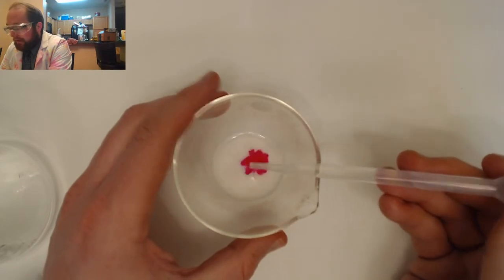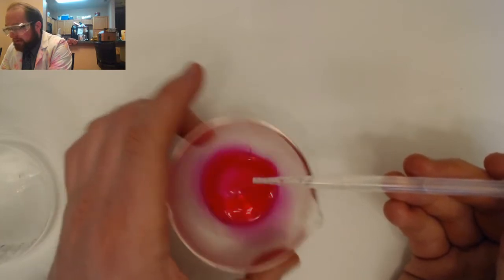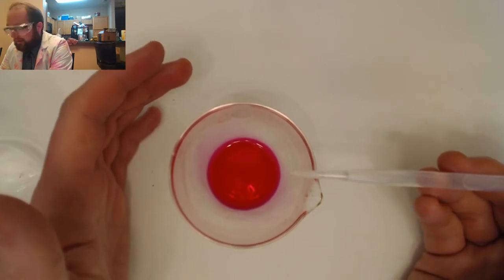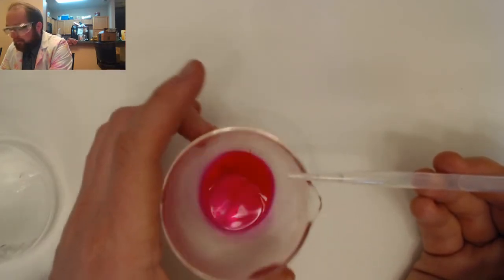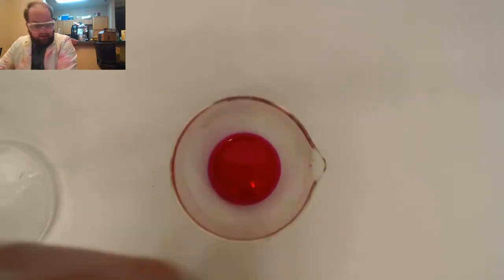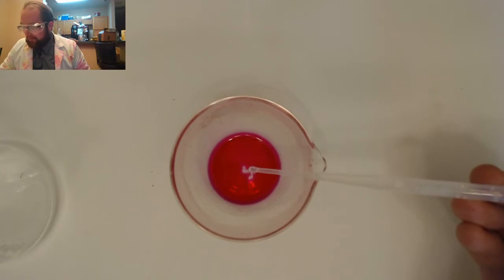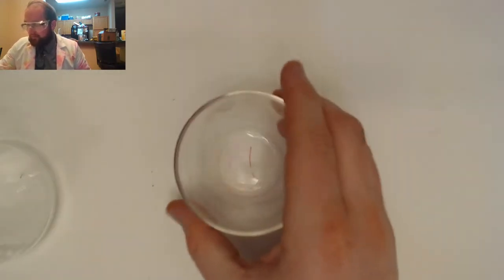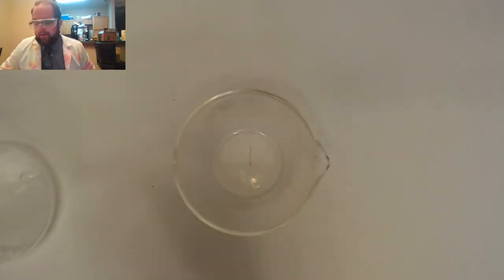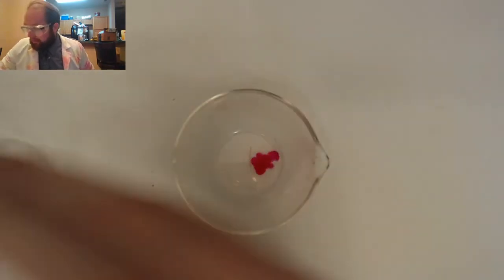And I'm going to take a few seconds here, and I'm going to react these guys until we have a situation a little like this, where, hey, look, that pink is no longer going away. That means that there is more base in here than acid. I have canceled out all of the acid. Now I could go the other way here, and I could add some acid back, and we should see that base go away. Okay? So what I'm looking for here is I'm trying to reach a very nice point where we are at that equivalence, where the acid and the base are equal.